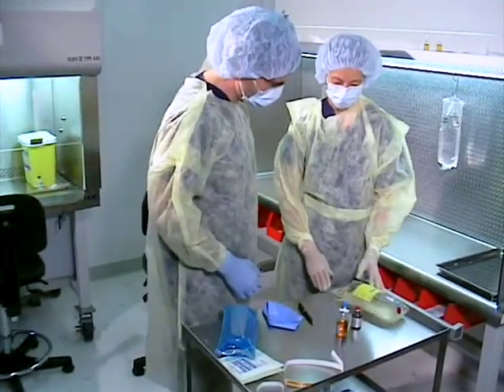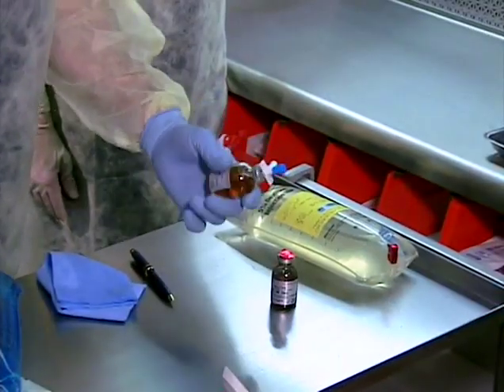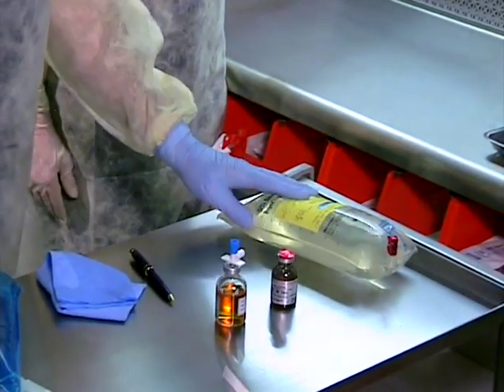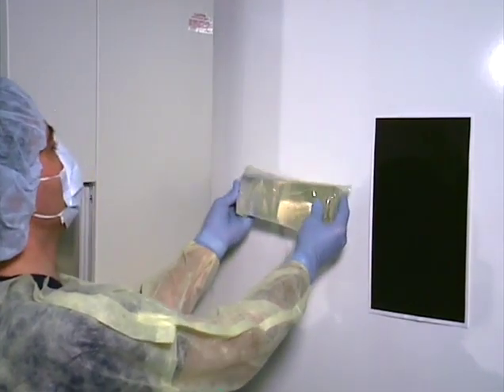The finished containers and vials should be presented to the pharmacist for the final check, and the pharmacist should also check for particulates. This redundancy will assure the best possible accuracy and surveillance of the product.